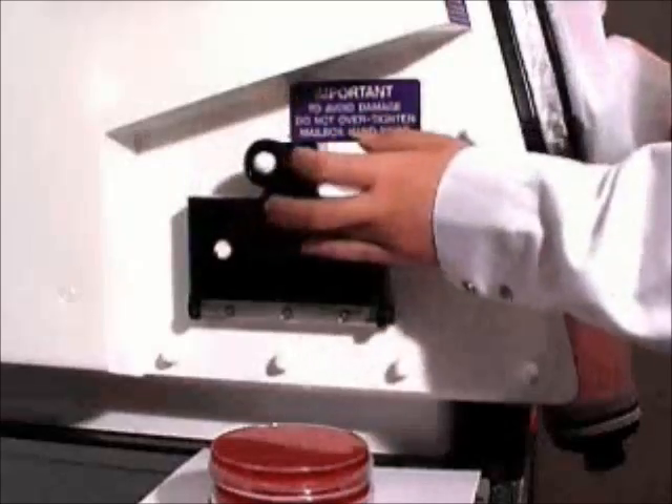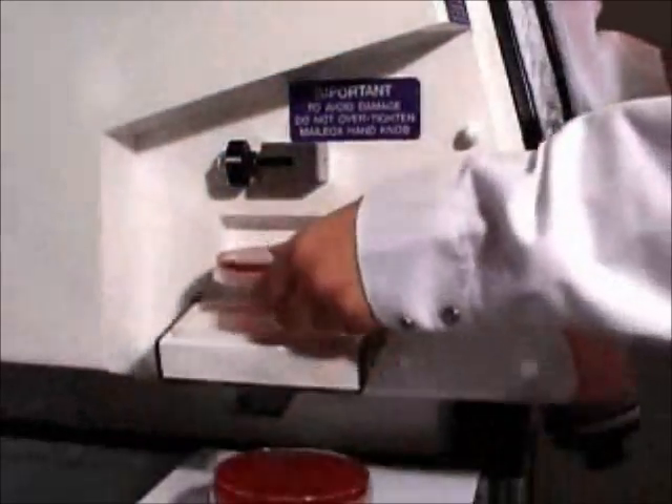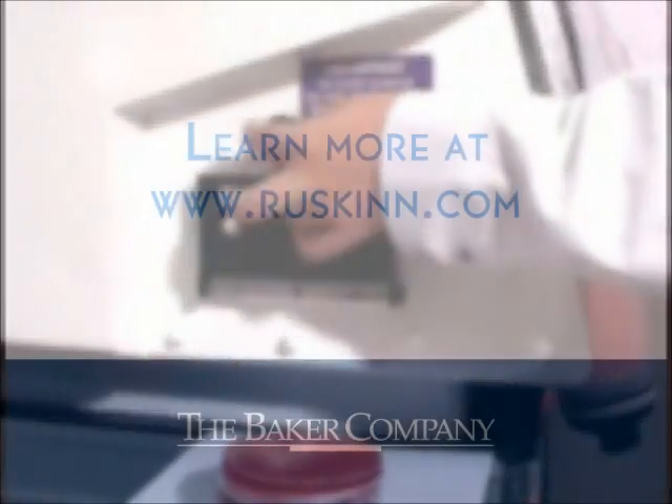The Ruskin Single Plate Entry System provides the facility to quickly and conveniently introduce samples as large as 15-centimeter dishes into the workstation without disrupting the preset oxygen level maintained inside the chamber.